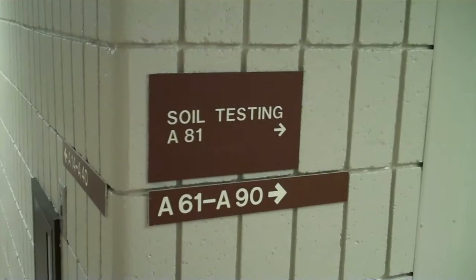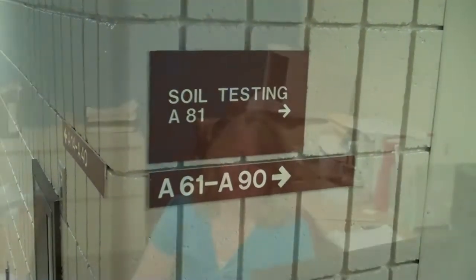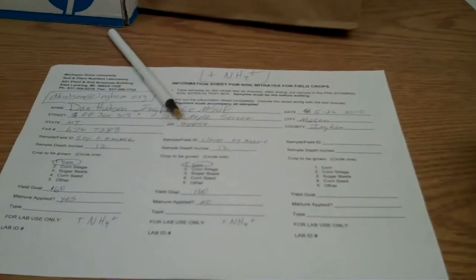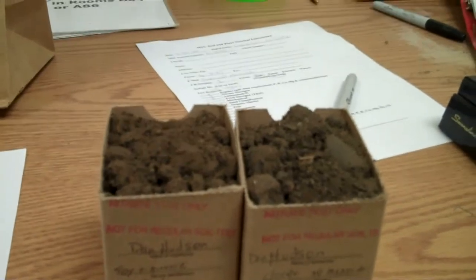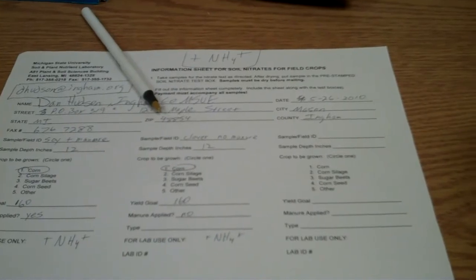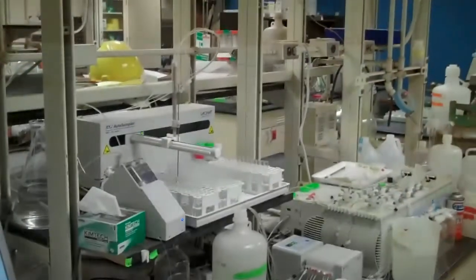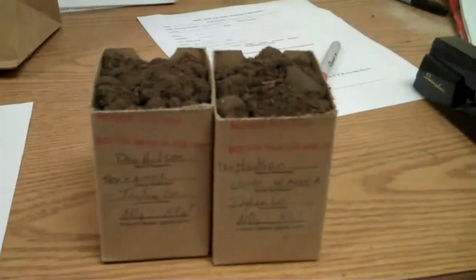The soil testing lab is located in the basement of the Plant and Soil Science Building on the campus of Michigan State University. Once the form is filled out and the boxes are filled with soil in the lab, they will be dried and then the recommendations you receive are based purely on the nitrate levels that will be measured. This is the laboratory where the samples will be run by technicians and the lab supervisor, John Dahl. Turnaround time is generally about two days.